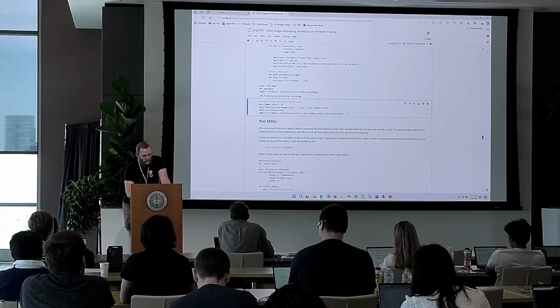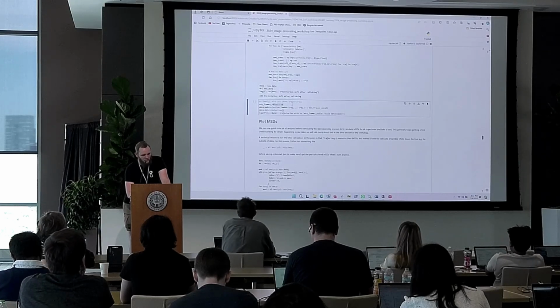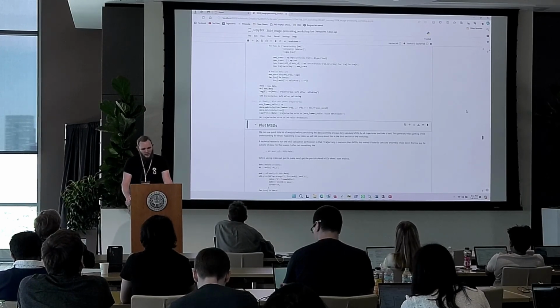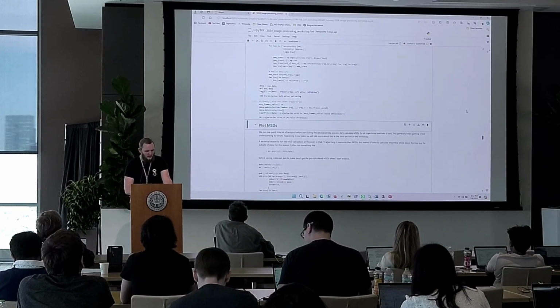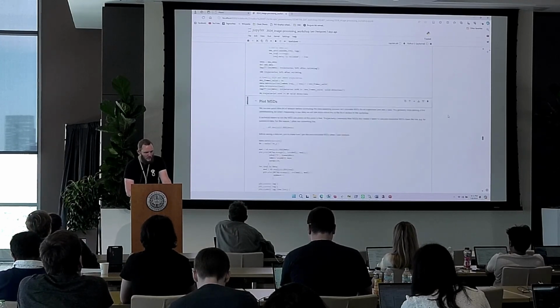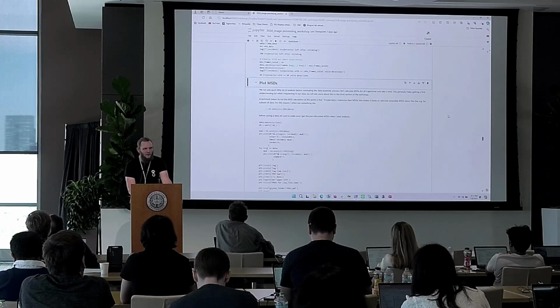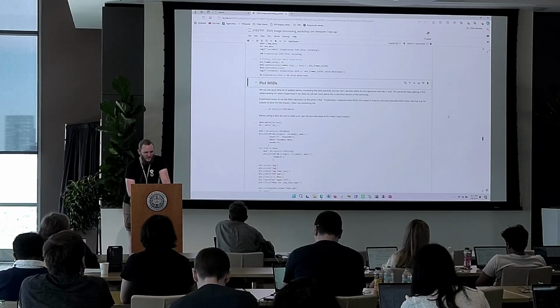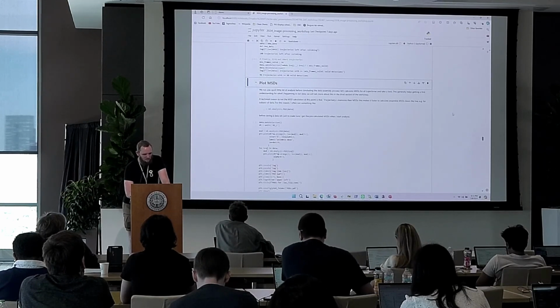It's kind of nice. And then at the end of the day, again, we filter for trajectory length, where we kick out everything that's shorter than 10 frames. Those are not really useful in the kind of analysis that we want to do later on. So at the end of the day, we're left with about 100 trajectories that have decent length. And that's a pretty cool data set, given that this all comes from a single nucleus that we observe in the microscope. Of course, in a real scientific setting, you would record more movies and get a lot more data than this. But for now, we got 100 trajectories out of this one nucleus. That's pretty cool.